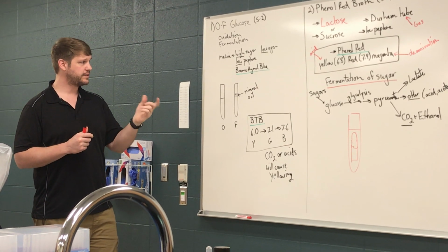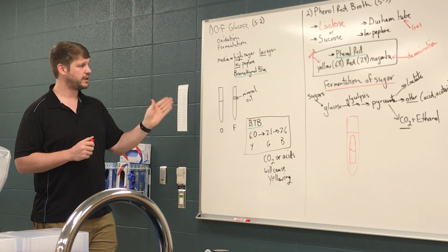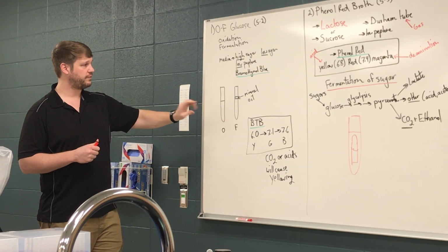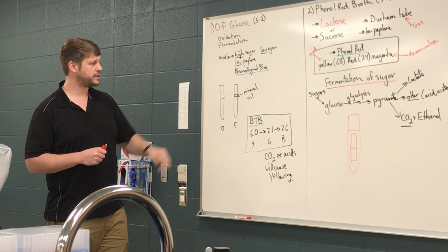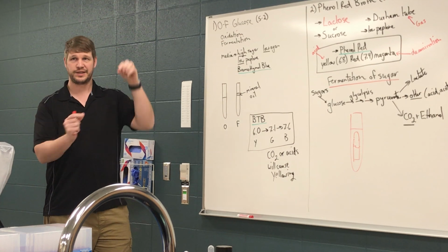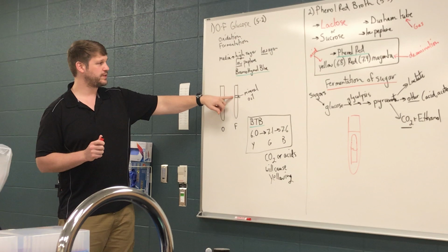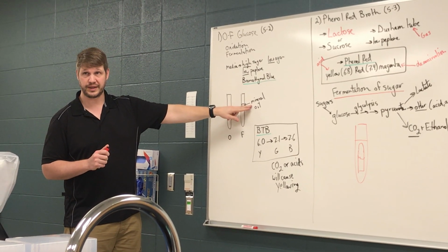How do we get some degree of differentiation between oxidation and fermentation? We actually are going to inoculate for each organism that you're testing 2 tubes. One of them you're going to leave the top open, and by open, I still mean putting the cap on, but you're going to leave it open as opposed to the second tube, which you're going to put a layer of mineral oil on the top.